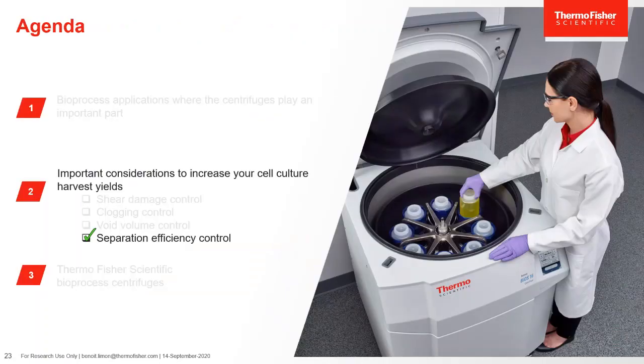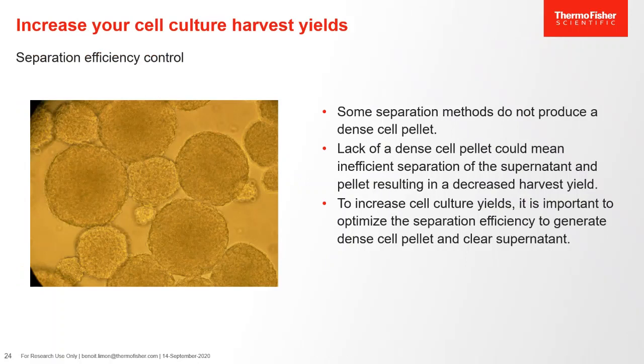Moving along, our last consideration today is separation efficiency. And Benoit, will you continue on with this control? Of course, Titi. The control of the separation efficiency is the fourth control we will examine today. And this is also key to increase the yield in the cell culture harvest.